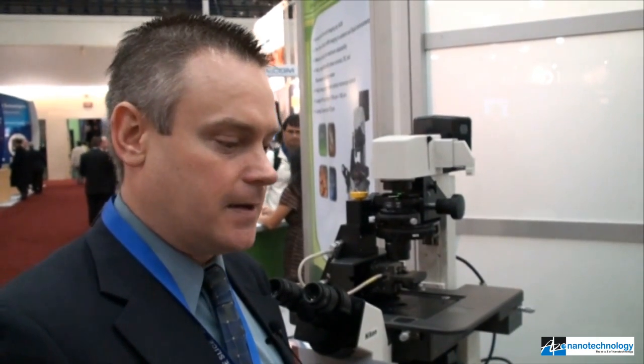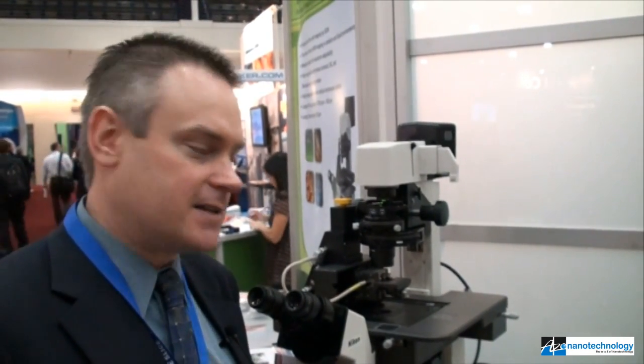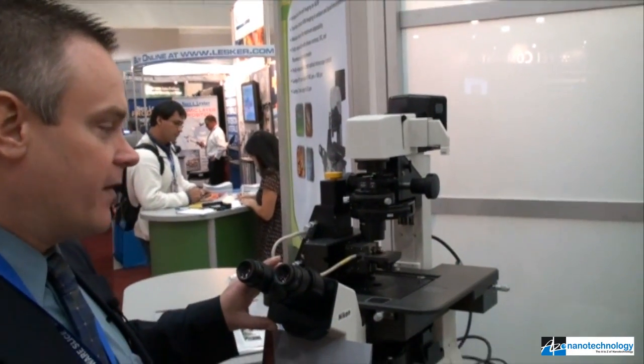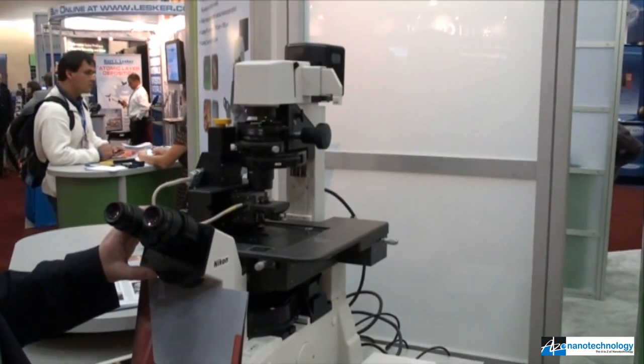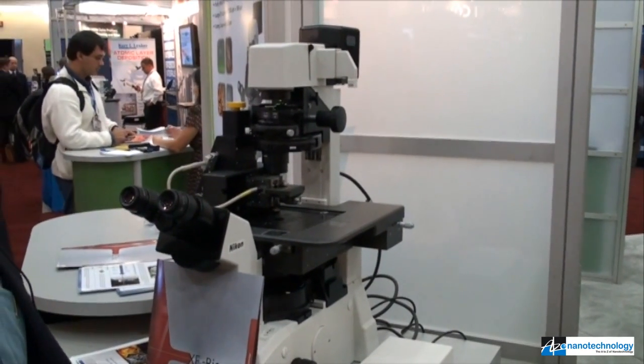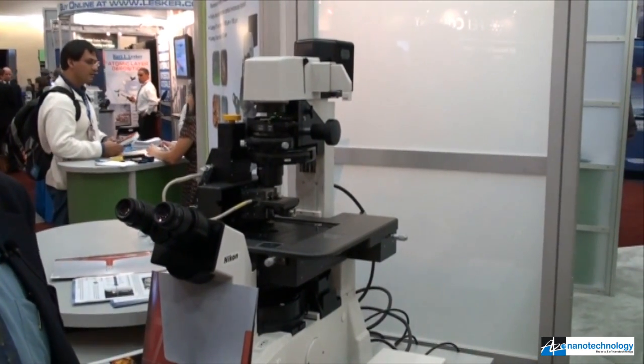It's a very non-destructive technique for scanning a live biological system in fluid, and gives the ability to look at real-time fluctuations of these living systems. The big benefit of the XE-Bio system is this new scanning ion conductance microscopy, which is combined with fully functional AFM capabilities, as well as a stage that is configurable with most all of the commercial inverted optical microscopes that people would already have in their labs. Thanks very much for telling us about the Park Systems XE-Bio.